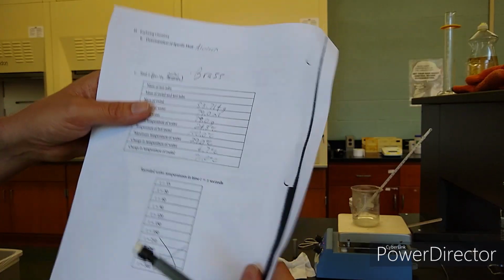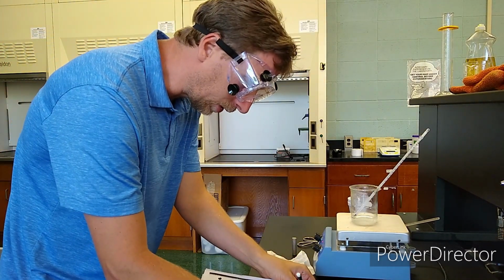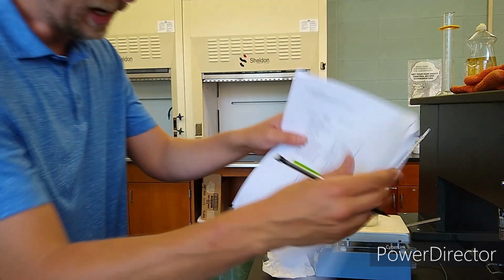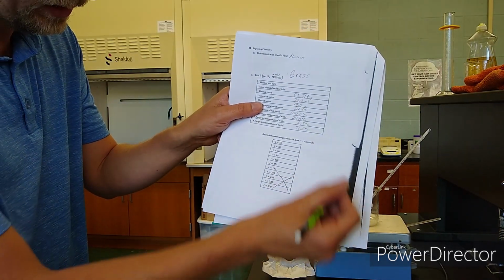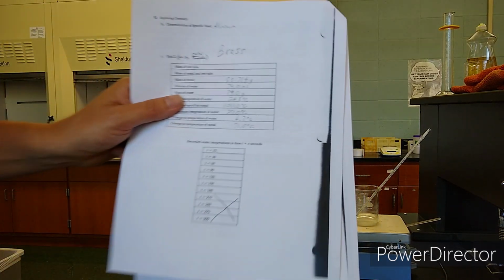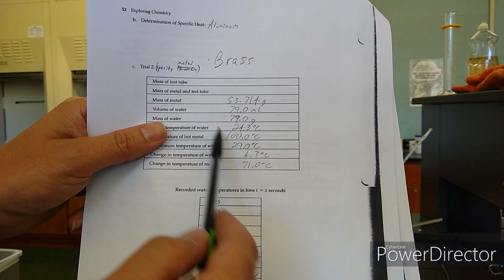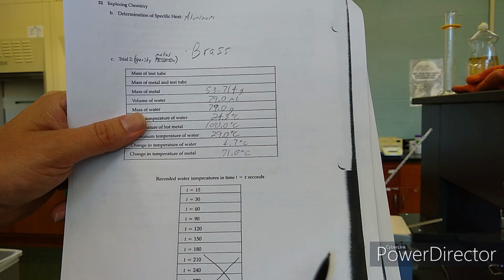Okay? Then you turn the page again, and it's determination of specific heat. Well, that's where the brass calculation is supposed to go. Of course, you can calculate it down here, the specific heat of the brass, if you want to, because all the data is right there conveniently for you to write into the formulas.